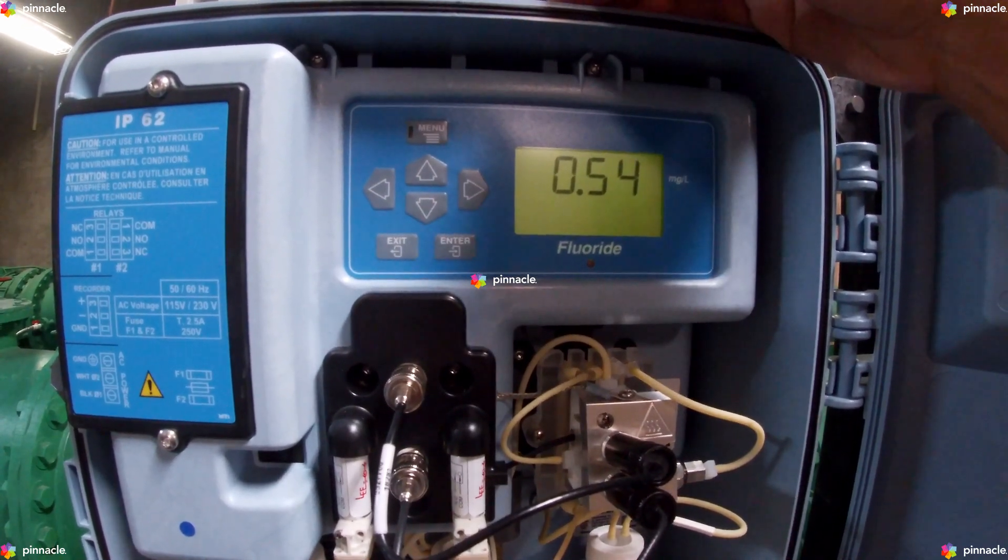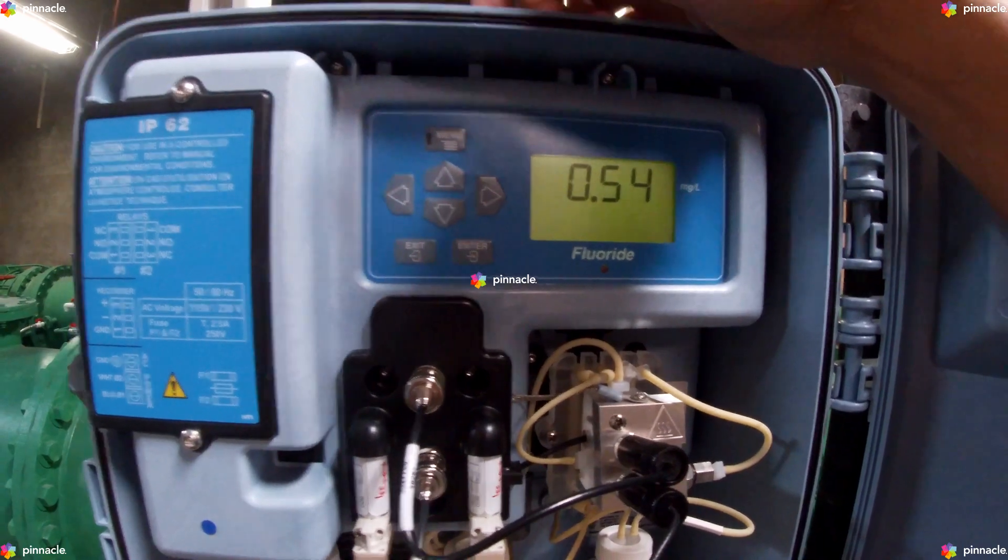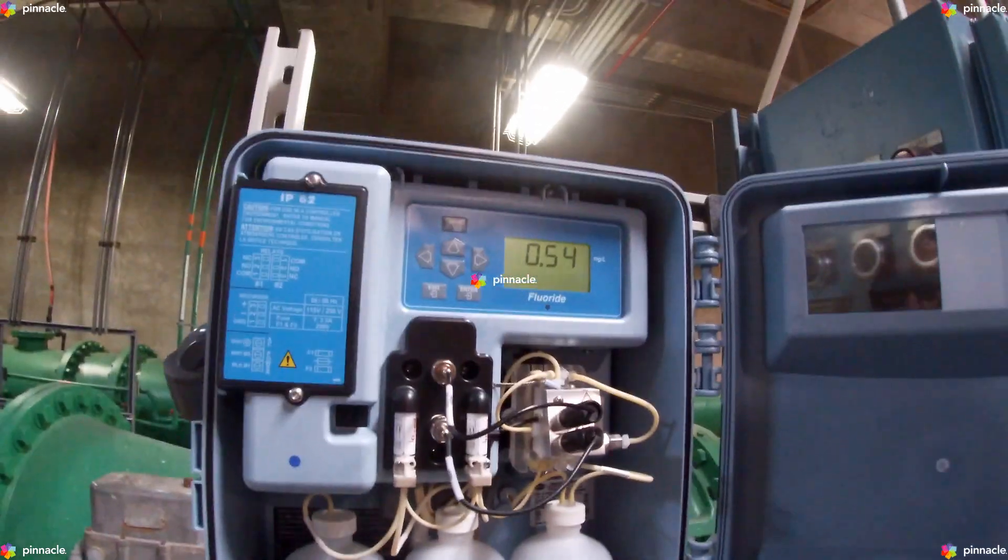Each cycle takes approximately 45 seconds to complete.